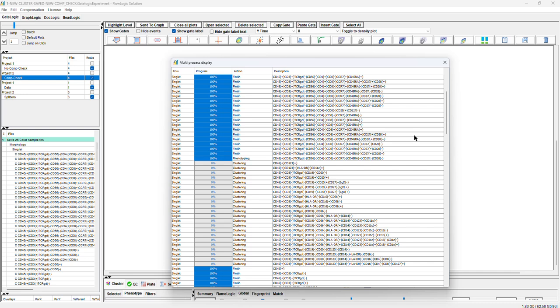So in practice, in a couple of minutes, you will get all your data analyzed and you have practically nothing to do, apart from, at the end, checking the result for your target, which is again just a few clicks. We are available for demonstration, we are available for tutorials. If you need help, just contact us. We can show the process with your files.